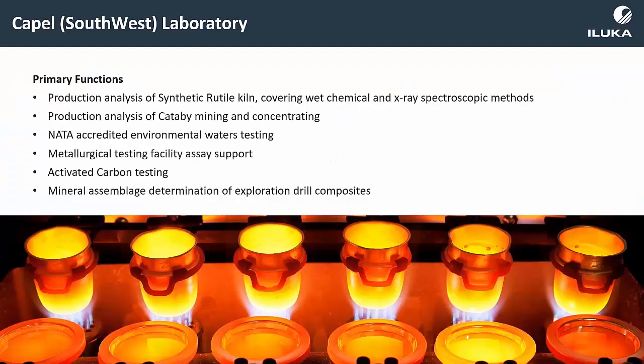Just a bit about our laboratories. In the southwest, our southwest laboratory supports the operation of the synthetic rutile kiln. They use a multitude of different techniques, X-ray analysis, so XRF, XRD, and wet chemistry.